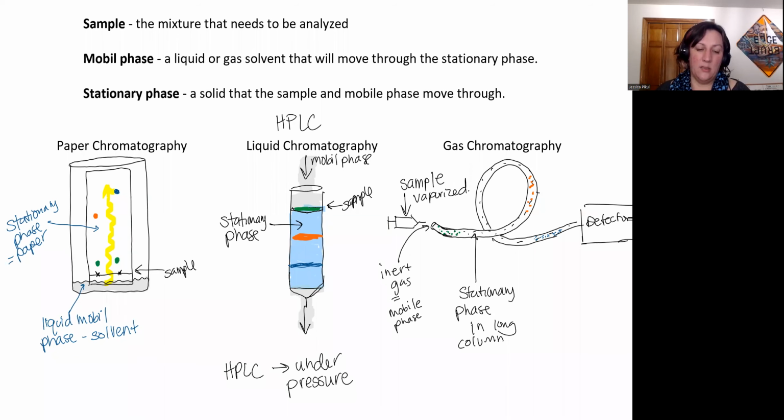But we're going to focus on this piece here of chromatography because it pairs very nicely with everything that we've been learning about extraction and forming solutions and the intermolecular forces that really guide that process and allow us to make predictions and to design extractions to maximize the compounds that we really want to isolate.